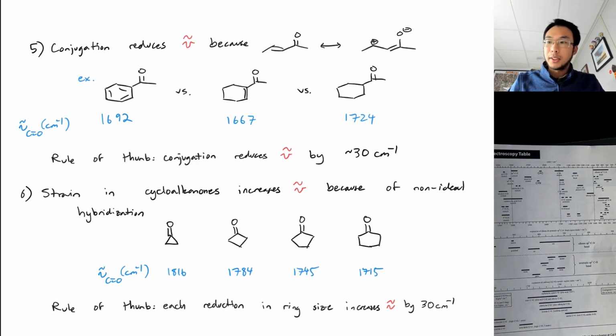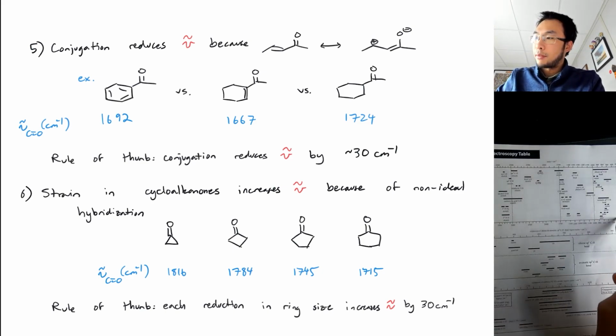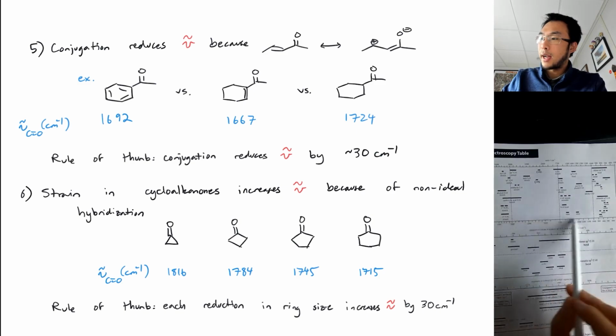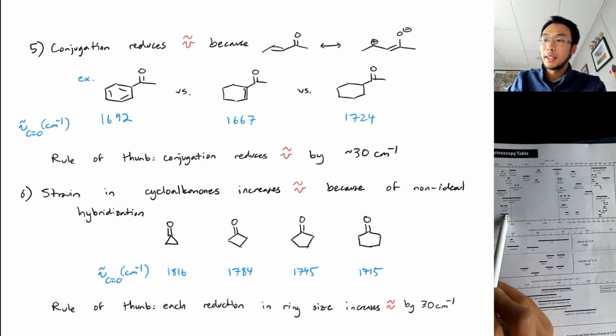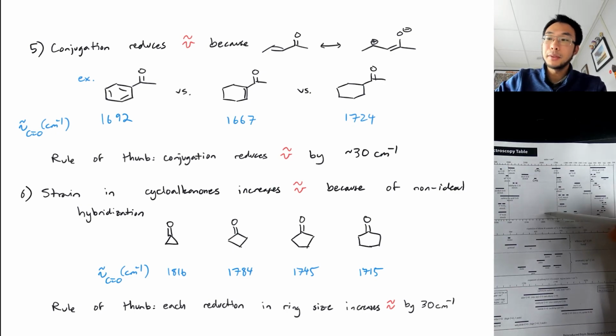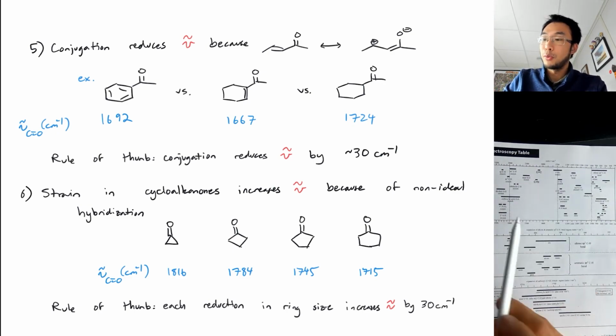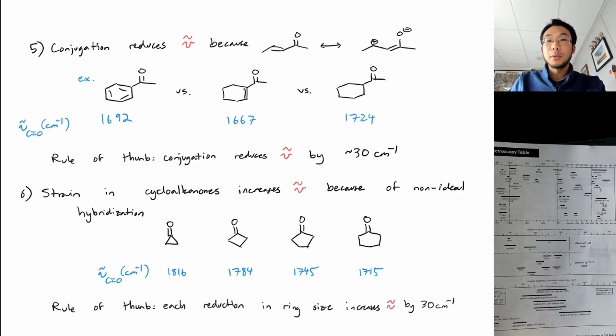Just to explain what's going on here, what this is showing you is that for a typical IR, the X location where a peak might show up is given by these black bars here. The spacing on the vertical axis means nothing in these data tables. It's just to make things fit. All you really care about is the X-axis position. So it's important to remember that these are ranges and that these ranges are a little bit flexible. So they're helpful, but they can also be imperfect.